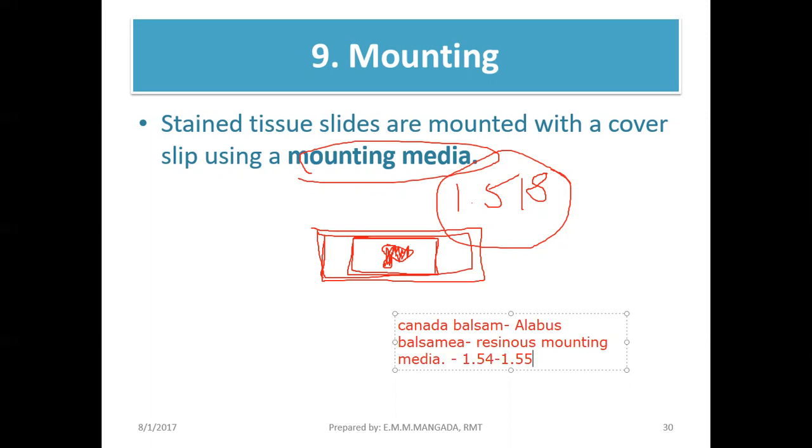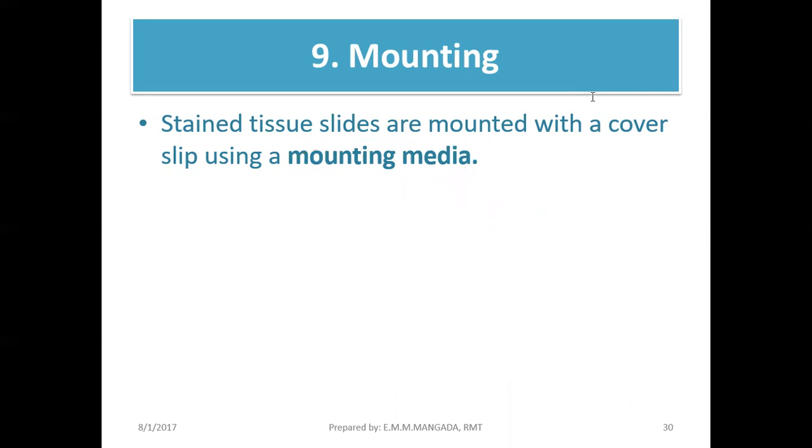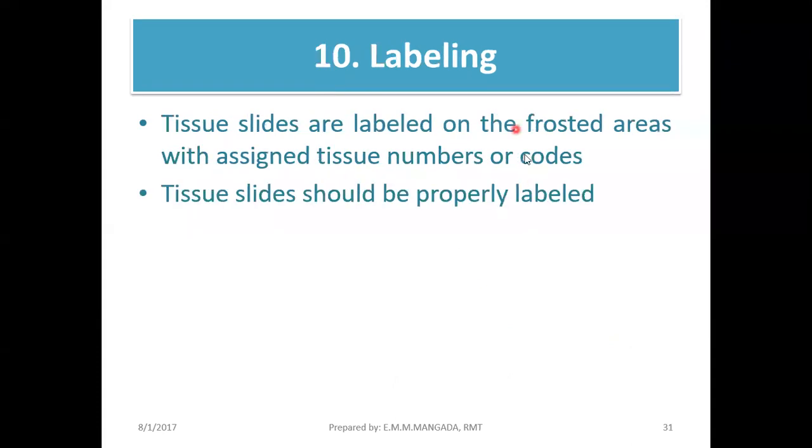What's again the purpose of mounting? Again, to prevent the stain from fading, or the stained tissue from fading its color, and of course to protect our tissue from scratches, or to protect it and for it not to be eaten by your ipis or daga. And then finally, of course, we have your labeling.